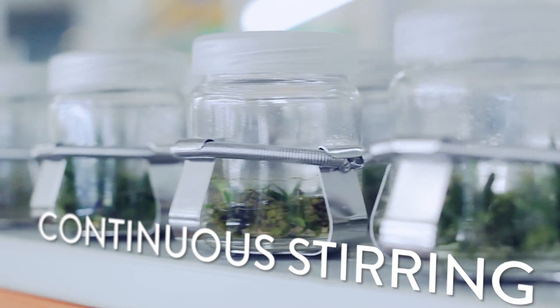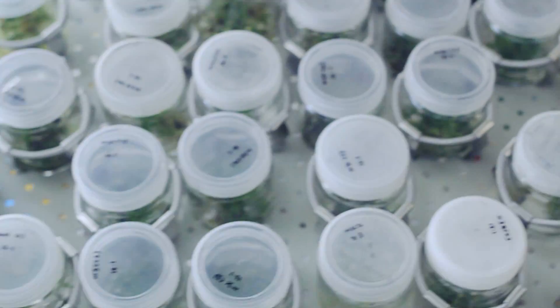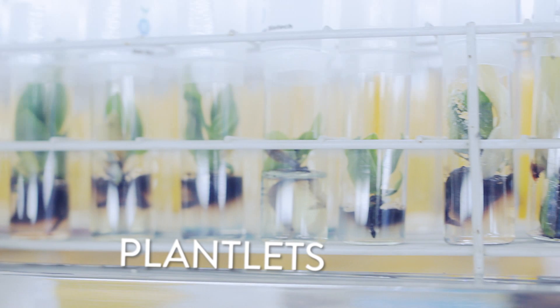During incubation, the tissue is placed in a liquid solution and stirred continuously. This is to create more shoots or roots, which can then be used to make even more clones.